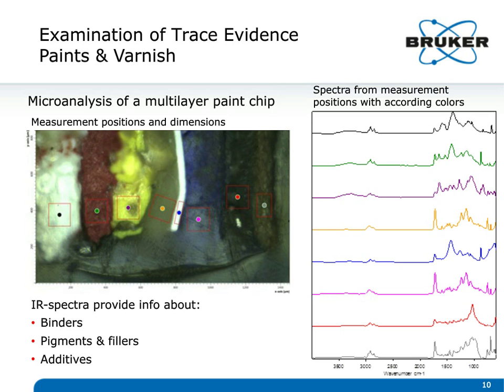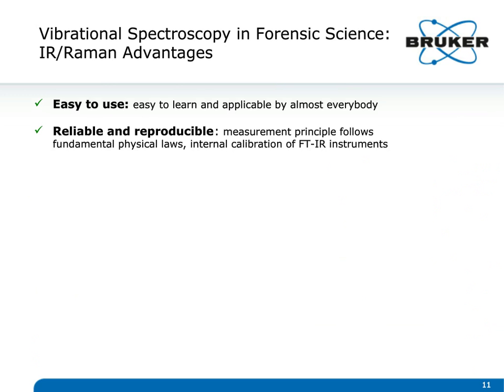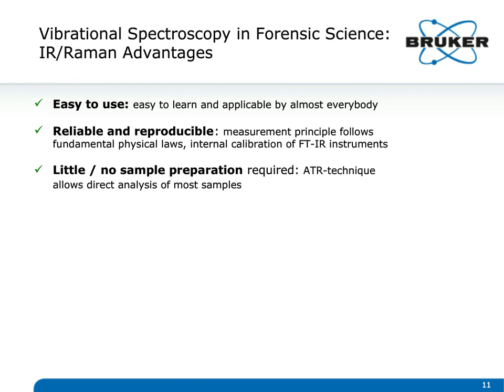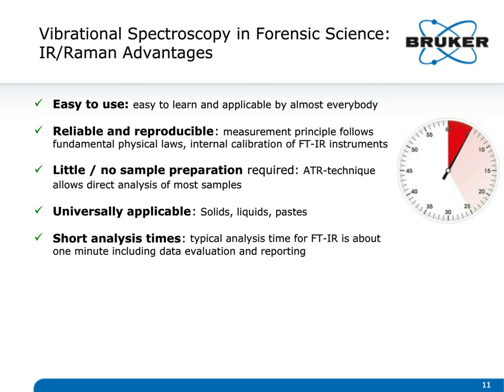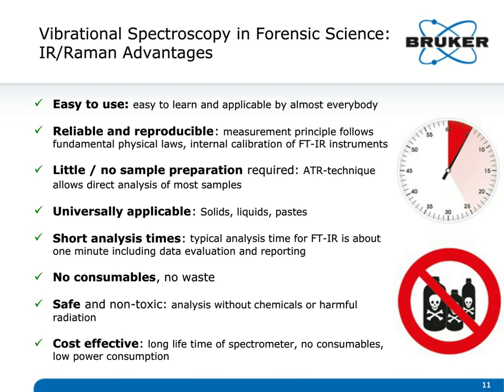So to summarize the advantages of vibrational spectroscopy in this very short 10-minute presentation: first, it's easy to learn, very easy to use. Maybe historically it was a problem where you figured you had to be an expert to be able to do an infrared or Raman analysis. That's just not true anymore. The competitive marketplace has dictated that things have become much easier and much more powerful in how they can be used by a very inexperienced user.